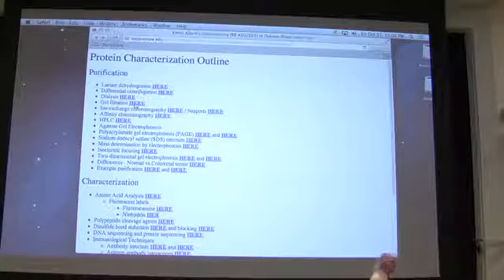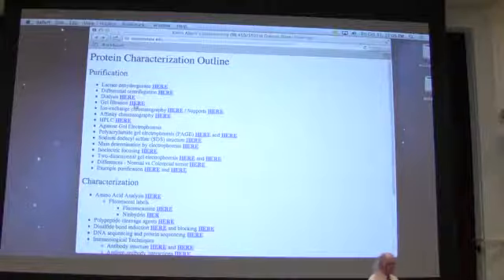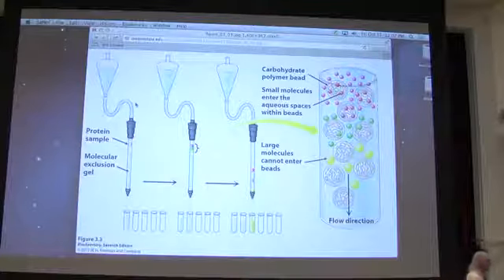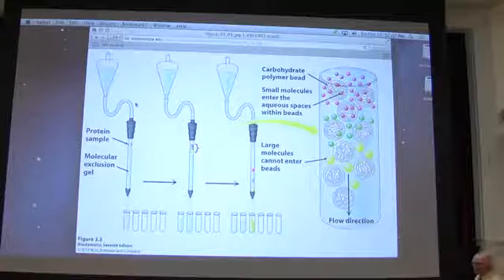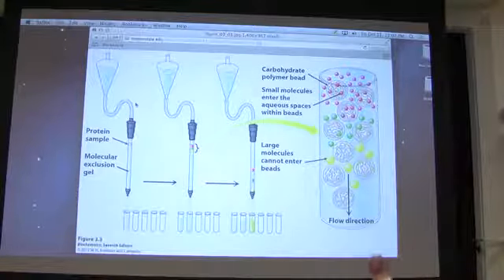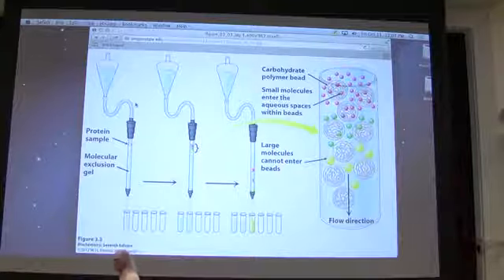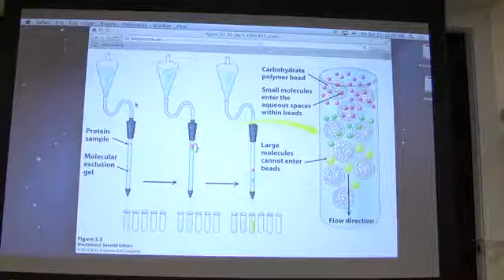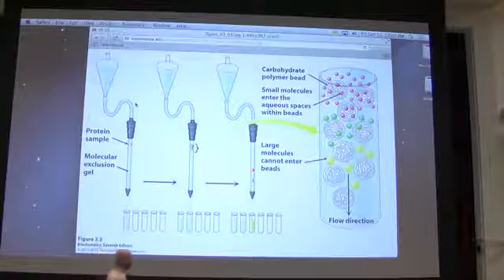There are other ways of separating big from small that don't involve dialysis tubing, and they may involve separation of bigger molecules, for example, that wouldn't fit through a dialysis tubing. All right? This technique called gel filtration, which is also called molecular exclusion, gel filtration equals molecular exclusion, involves a very cool trick. Okay? Well, as you'll see in these various techniques that I'm going to show you, the materials that are doing the separation are typically used in what are called columns. And the material that does the separation is actually shown over here on the right. So it's sort of an enlargement of what's in there. And I'll tell you a little bit more about that.